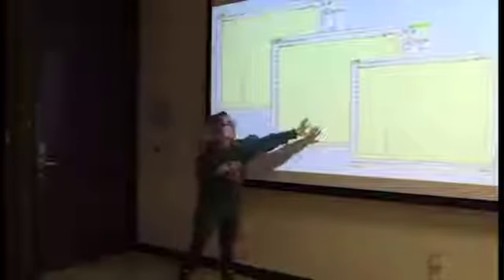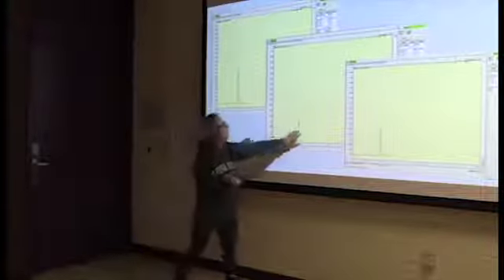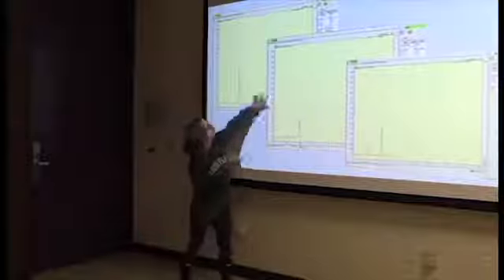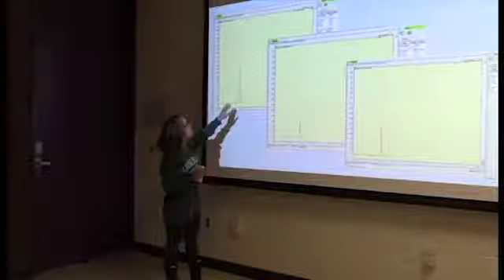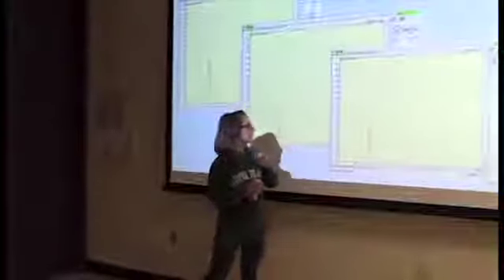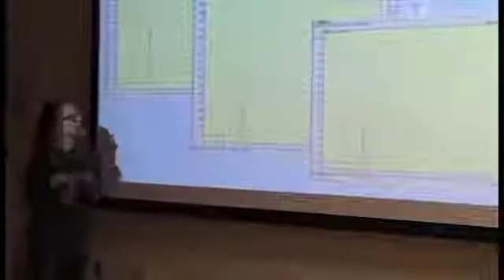And these are just the 3 peaks that I told you about. This is 1-to-1, and I know it looks a lot smaller. It's just because the variability was different. But this is the 1-to-1, this is 1-to-2, and this is the 1-to-3. And you can also see the little iron peaks increasing.